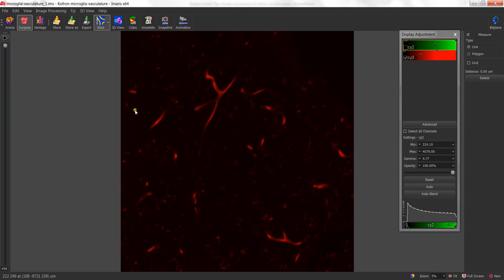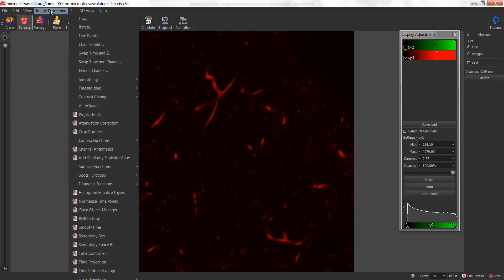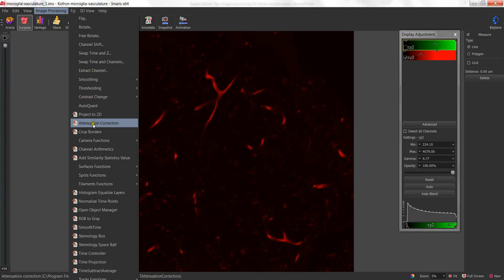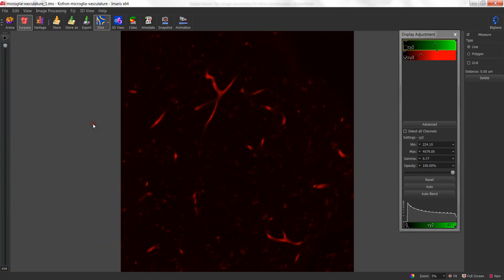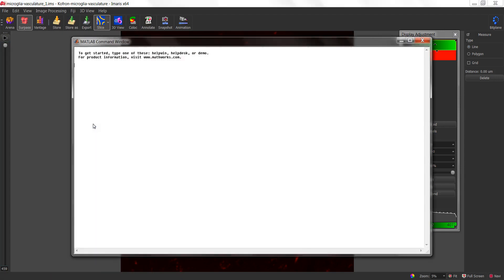Once I have those two values, we can go into the image processing menu at the top of the Amaris window and scroll down to the attenuation correction option. Attenuation correction does have a MATLAB icon next to it, which means that in order to utilize this function, you do need the Amaris XT module. If I click on attenuation correction, it opens up a MATLAB window.